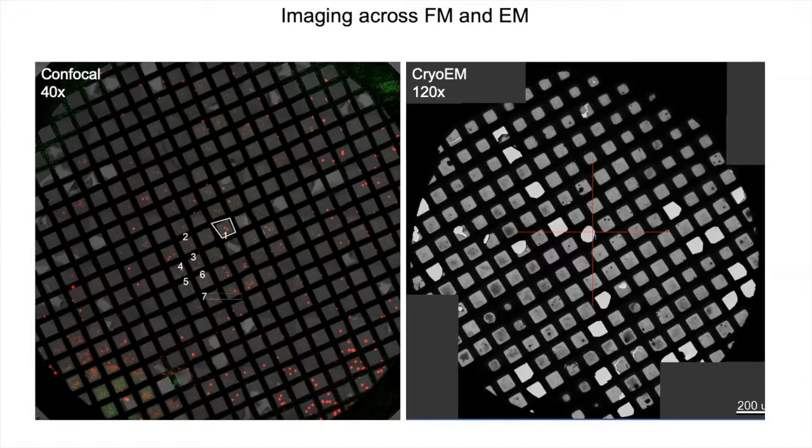Yeah, you say this could be a center. Then you see a broken square over here that will correlate with this broken square over here. Then you have a second broken square over here, diagonal to that. That will be about this. So in between these two broken squares will be this particular square where you have this big bead and a small bead, and those two beads are there.